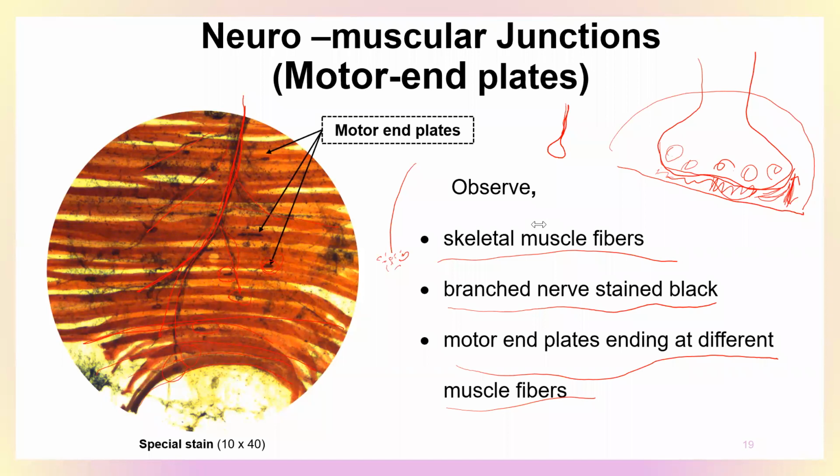Okay, articular cartilage. I'll do that. Radial zone, chondrocyte orientation. Okay, I'll do the articular cartilage again. Cardiac muscle is branched. Yeah, I know, right? So the thing with slides is that.